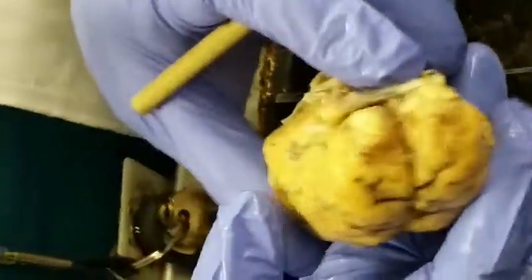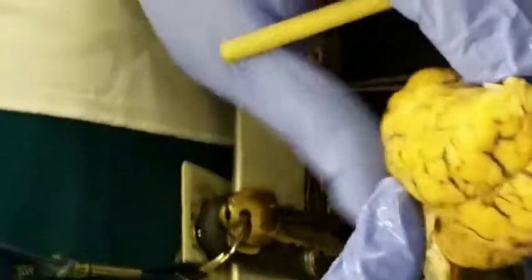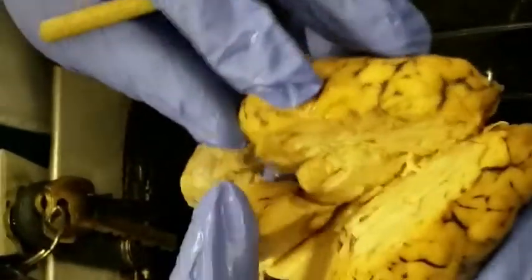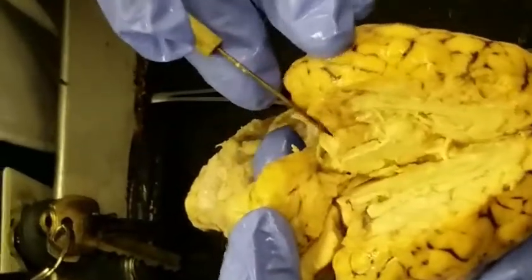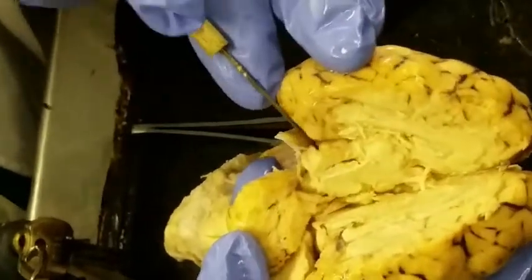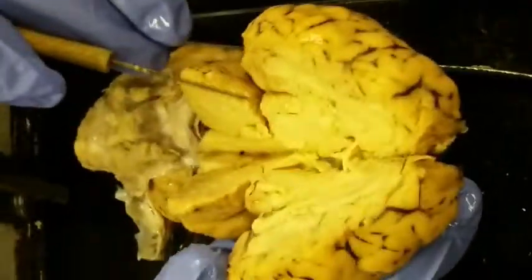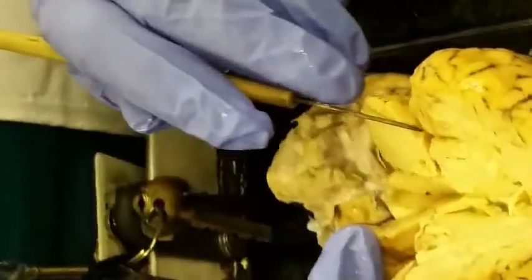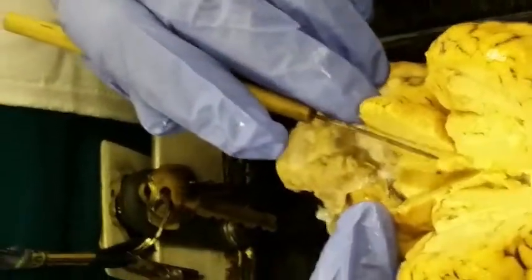Okay. And so now we're looking inside. This is beautiful. Let's see if you can point it out. What is this? Two mounds, a large one and a small one. Large and small, what are they? Those are the corpora quadrigemina. There you go. And very close to that, beautiful, what is this?